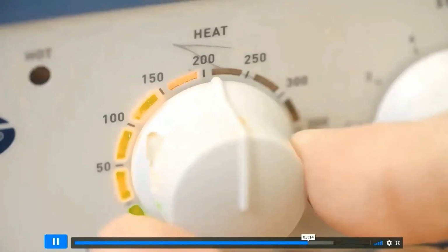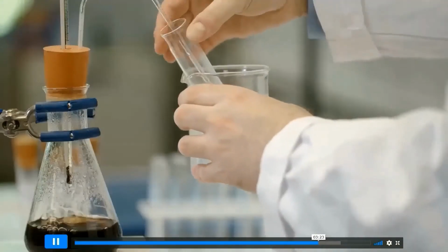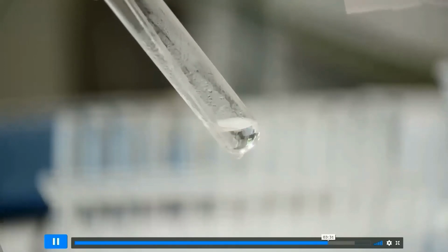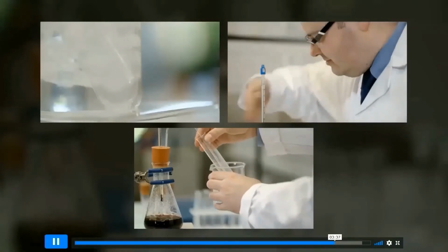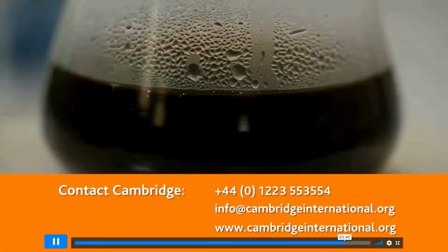The heat is increased so that the temperature rises steadily. Between 90 and 100 degrees C, a colourless liquid appears. The carbonated drink is allowed to boil gently until enough of the colourless solution has been collected. In this experiment, 3 components from the carbonated drink have been identified: carbon dioxide, food flavourings, and water. You noted down the 3 components in the process of simple distillation.